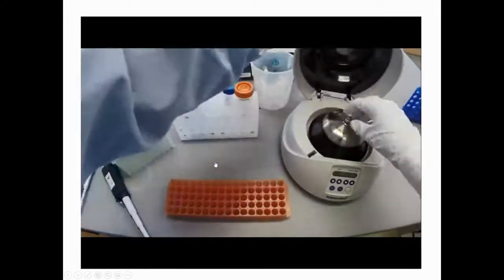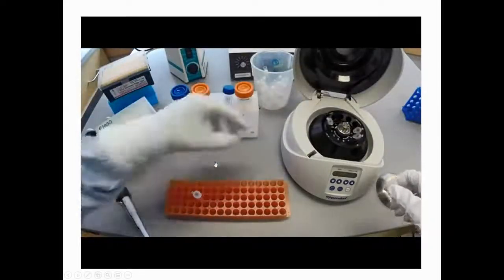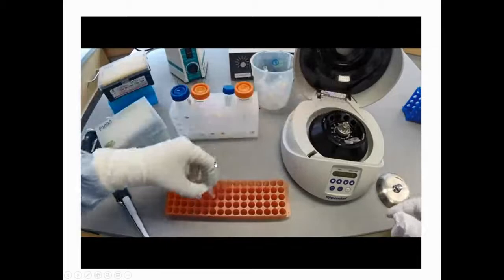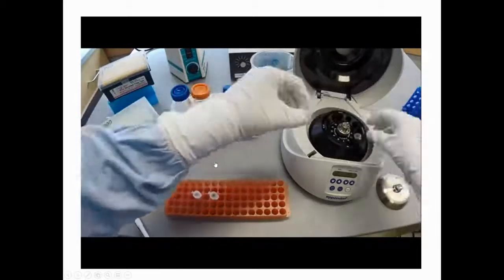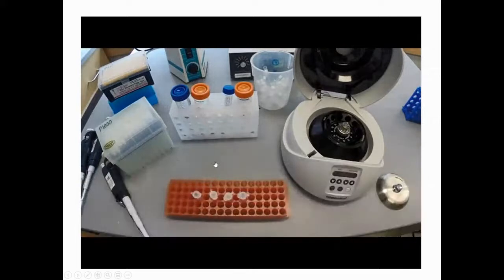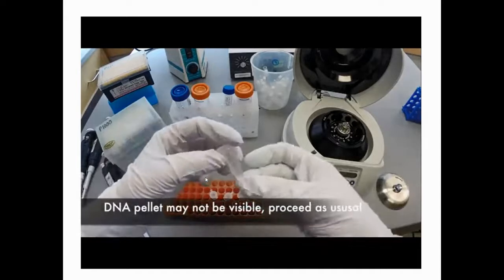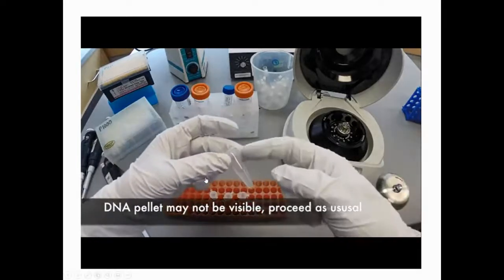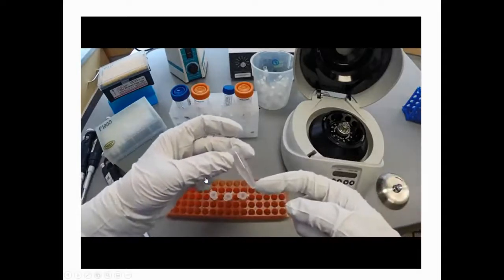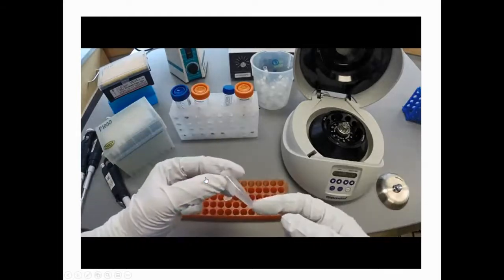Remove the tubes from the centrifuge gently, being mindful not to disturb the pellet which now contains your DNA. Yeah, because you use ethanol precipitation to precipitate the DNA. So you visually inspect for a pellet at the bottom of the tube on the side of the hinge. A pellet is not always visible, so you can choose to centrifuge again or proceed as normal.